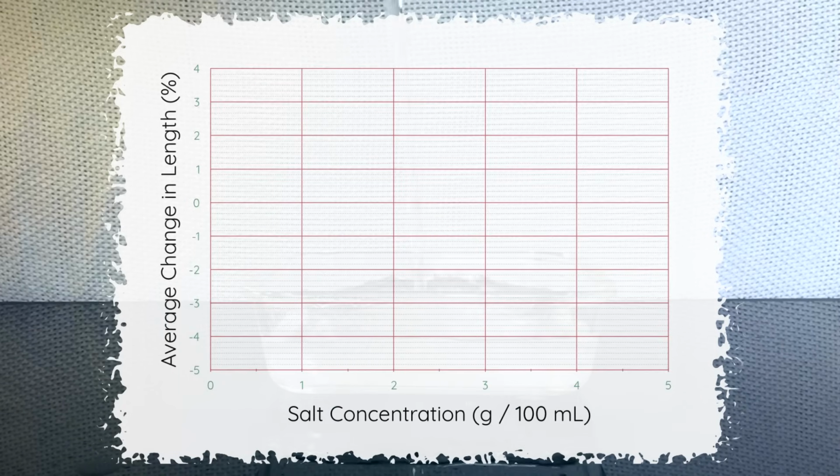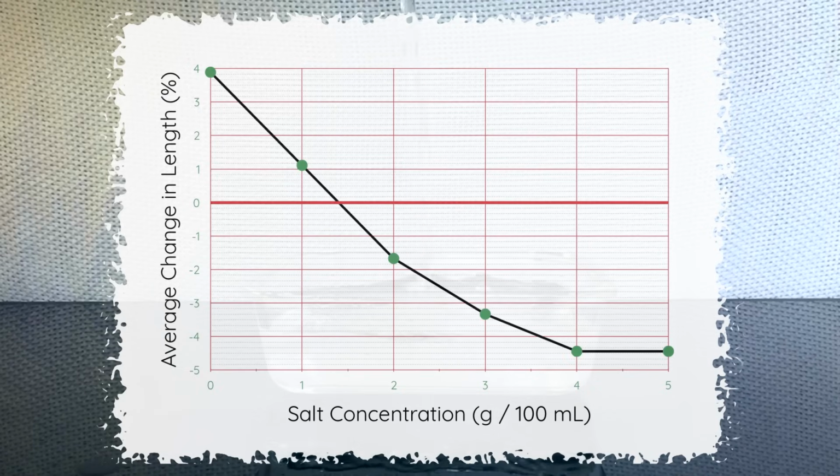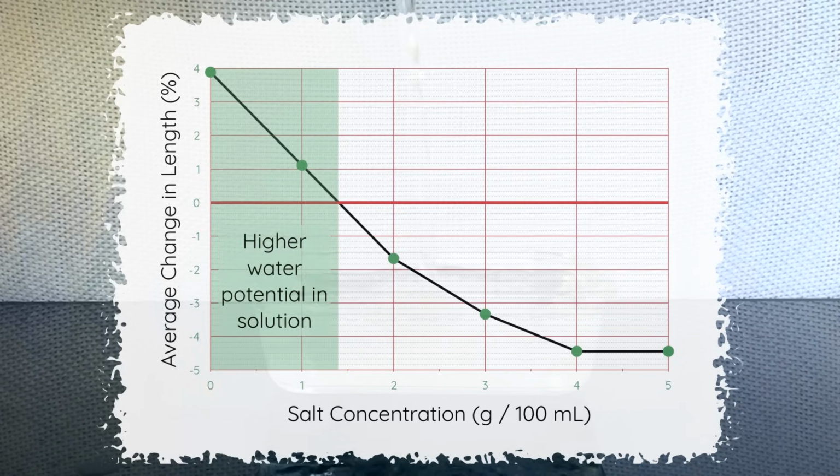The graph shows the average change in length against the salt concentration, and the results from this experiment show a nice downward curve. The lower salt concentrations result in an increase in length of potato strip, meaning water has entered the potato strips by osmosis. This means there is a higher water potential inside the solution compared with the potato. We have a hypotonic solution.